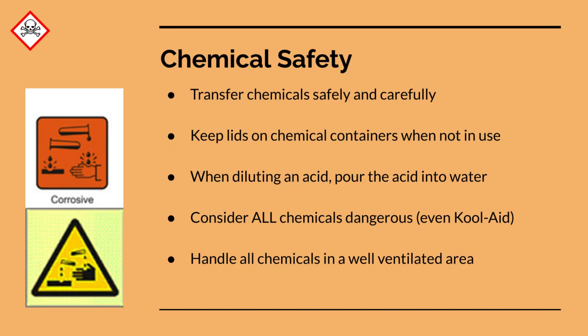Keep lids on chemical containers when not in use. When diluting an acid, pour the acid into water. Okay, this is a good one, though. Again, in most cases, you're probably not going to be doing this in my lab, but it's a really, really good practice, especially for you seniors, if you're going to be moving on to a science lab in the future, like, say, a college-level chemistry lab. This is something that you need to remember for that. When diluting an acid, pour the acid into water.